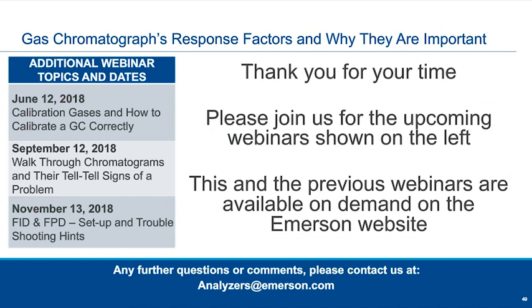Am I correct that the C6 plus category will not necessarily be enough information to accurately estimate hydrocarbon dew point? Absolutely correct. It's not related to this topic, but if you try to calculate hydrocarbon dew point from a C6 analysis, you basically have just as much chance of randomly guessing what your hydrocarbon dew point is. The accuracy goes up much, much more when you have a C9 plus. You definitely need to know what C6, C7, C8 you have running. So definitely do not use a C6 plus. We have some data sheets and application notes to show you the huge error rate if you're trying to do it with a C6.